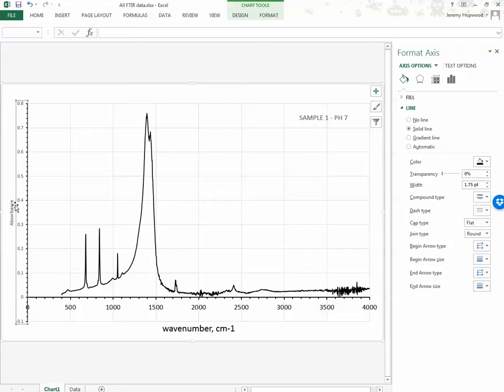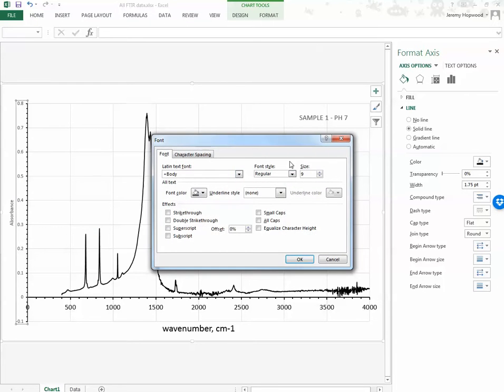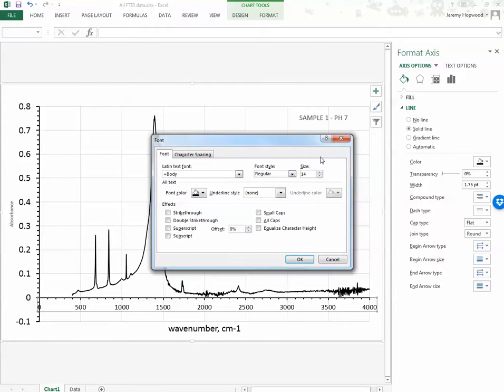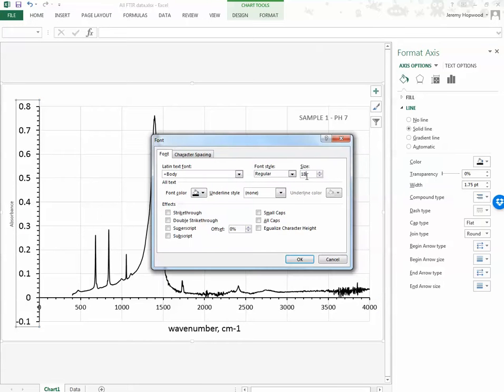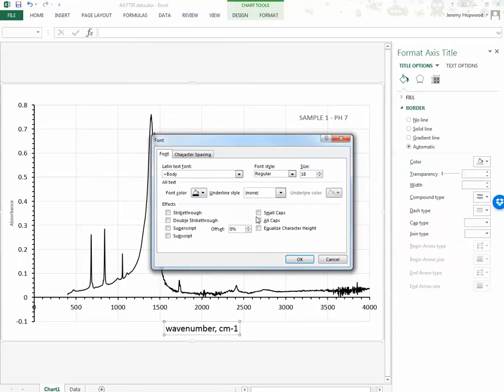So we go back over to here, click the area, font, I think we said it was 18, and we've given it black and white. Let's say OK. No, I don't think it was 18 on that one. Let's have a look. Let's click back font, and it said 14. So let's make this 14. Font 14. So now we've got that font 14, that font 14. This one was the font was 18.